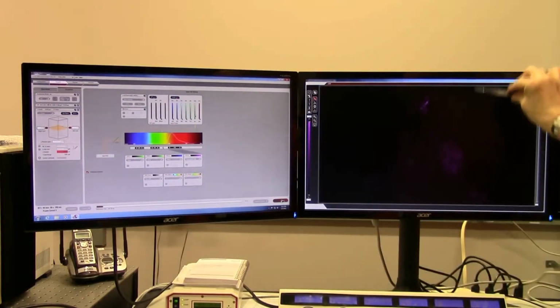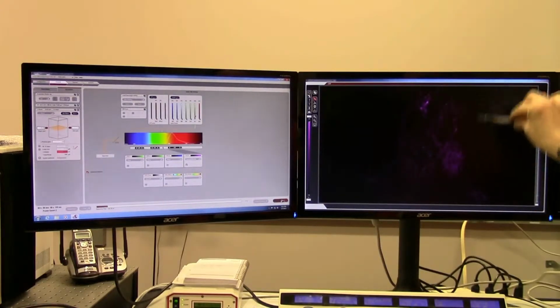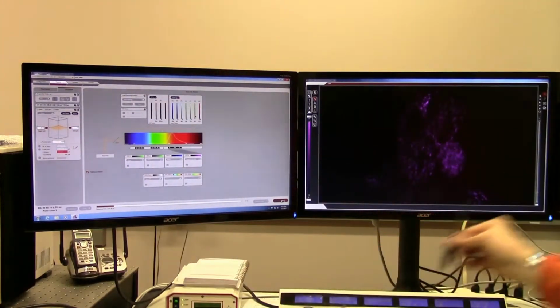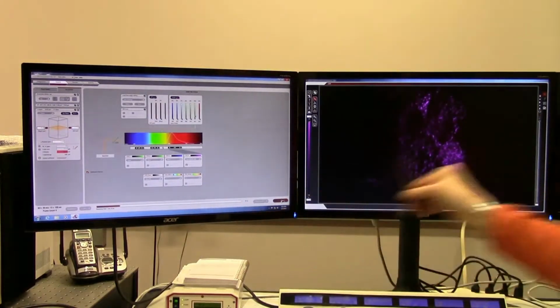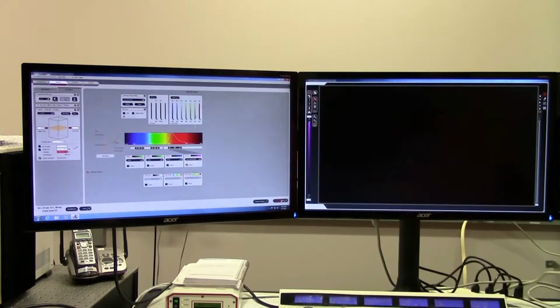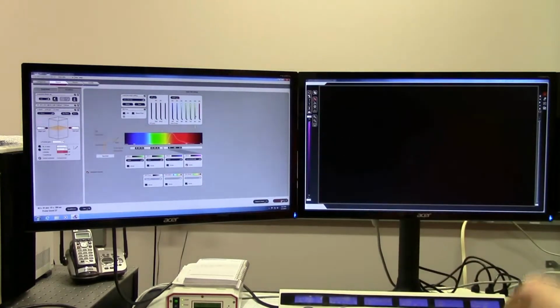And what you should be seeing is with each progressive scan, you're going to get more and more in focus until you're going to get to the central focal point, which should be halfway through the stack. And then you're going to go out of focus again as you now focus on the back. Okay, so once the experiment's completed, you're going to see now there's multiple options to visualize the data.